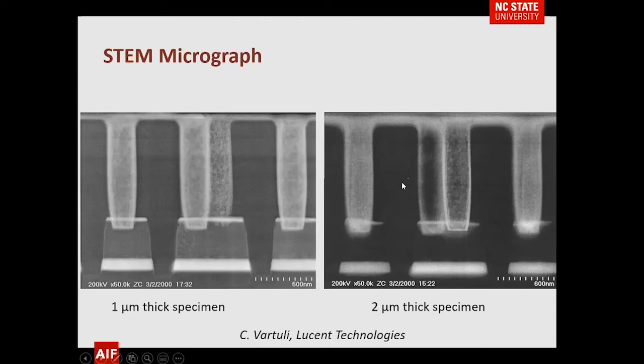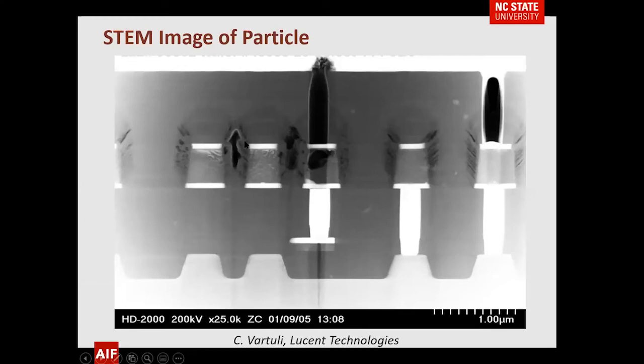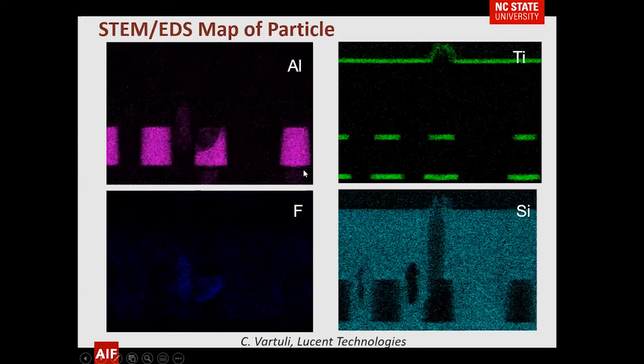To show how that was applied to solve a semiconductor problem, combining TEM and EDS: here's a cross-section where one via looks like it has tooth decay. An EDS image map of the same area shows aluminum, titanium, fluorine, and silicon — and you can see fluorine present in the via. What was happening is that cleaning solutions were getting down into the via and destroying it.